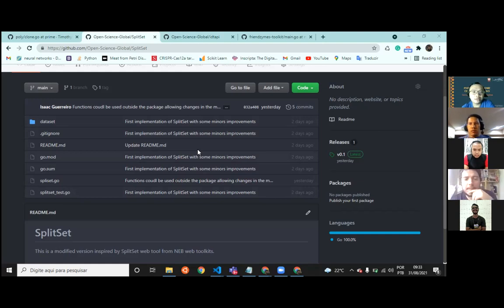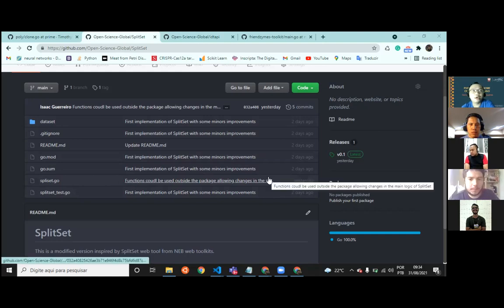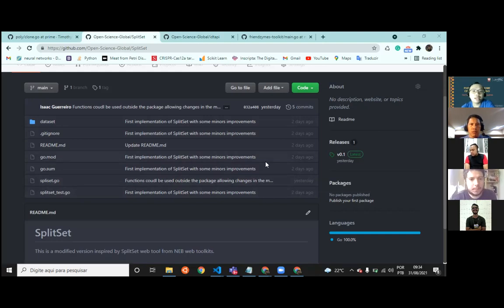Another thing is for G-block synthesis, we've recently contacted IDT for that. I'm not sure if this can be addressed by the software itself or if this is really the nature of G-blocks, because one limitation I found is when we use G-blocks for controls, especially for diagnostic assays for highly pathogenic organisms, wherein it's difficult to source a culture or any DNA or RNA material which can serve as a positive control. So we use synthetic controls instead.